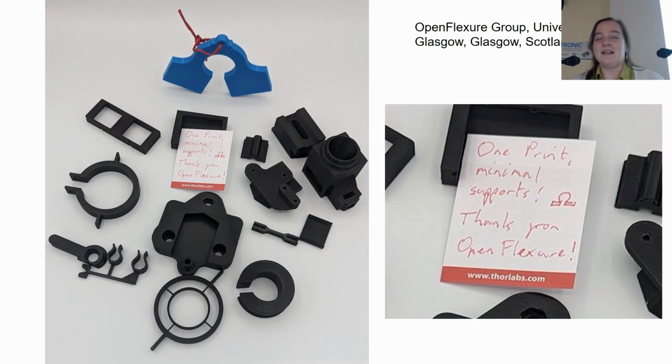After we shared this to the scientific community through GitHub and through the publication, we started to notice that researchers were reproducing this. So the Open Flexure group in Glasgow in Scotland are building an EnderScope. We have an EnderScope being built in Trinity College Dublin. We have an EnderScope being built in Maryland in the United States.